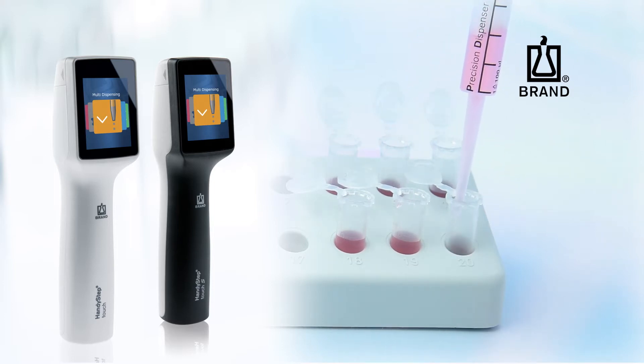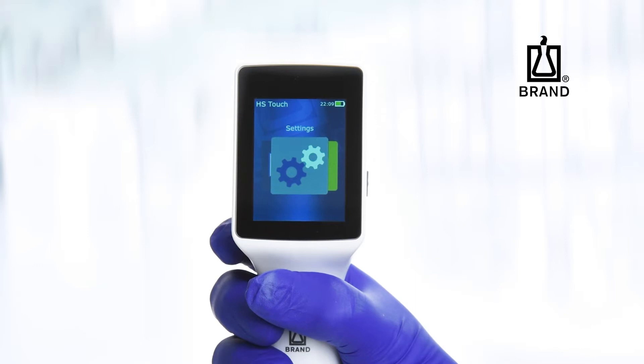This mode is ideal for a number of applications including reagent aliquoting, sample preparation, and setting up multiple PCR reactions.